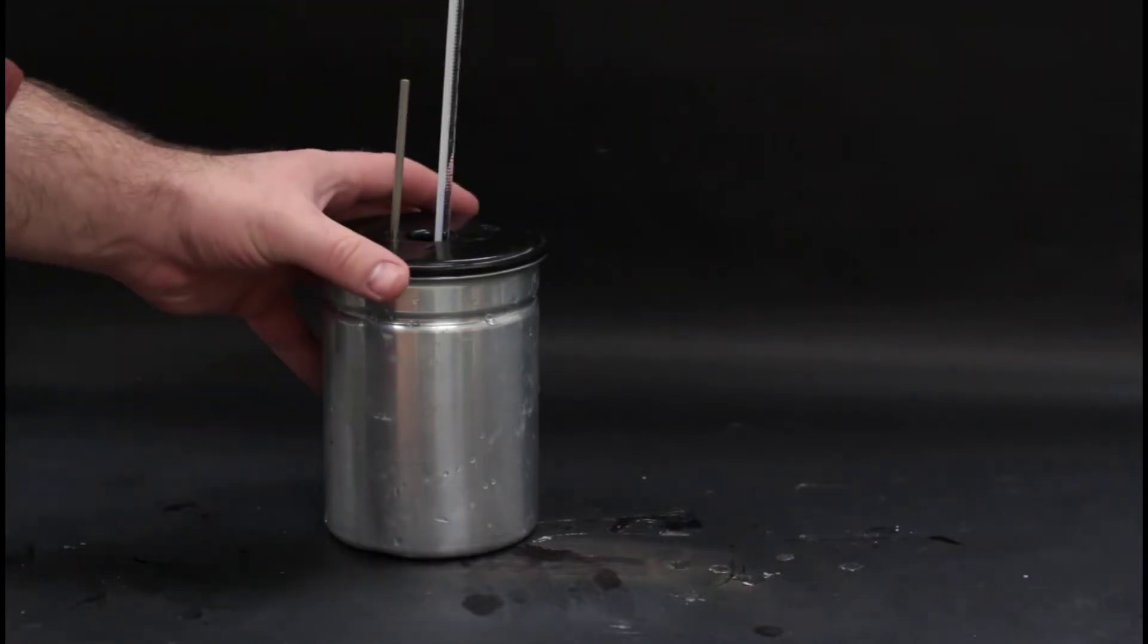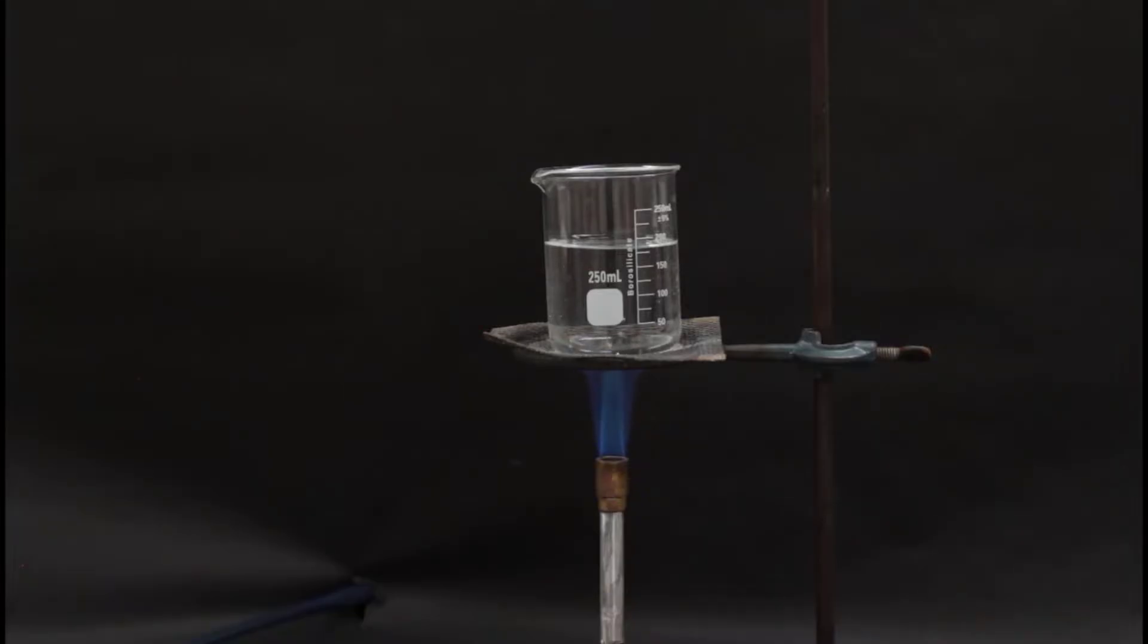It'll probably be the same as it was before, but you'll set up your ring stand and Bunsen burner. Fill the 250 milliliter beaker with enough tap water to cover your piece of metal and set it on the ring stand to boil.